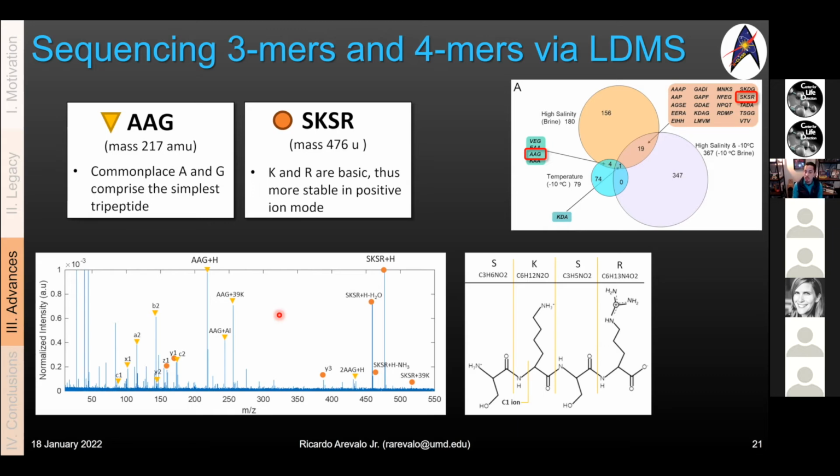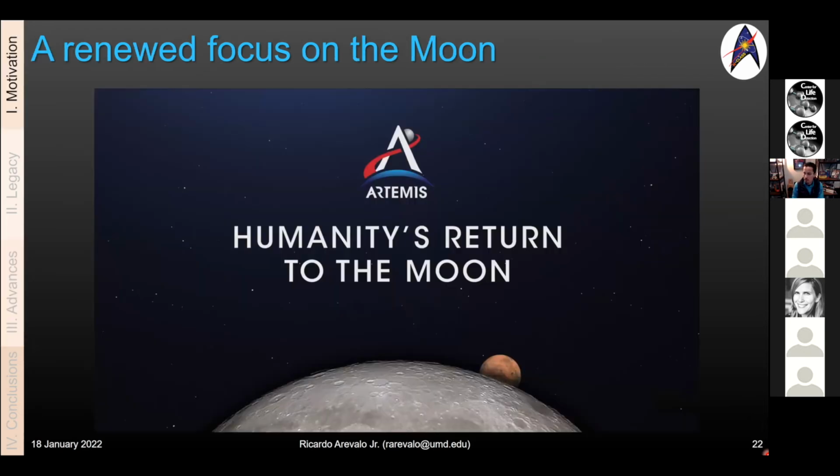And we can sequence at least a subset of the peptides that we've had the opportunity to analyze with our prototype instrument that meets the form and function of a flight model. We're able to see the molecular ion, we're able to see diagnostic fragments, and we're able to actually sequence these peptides. Okay, so I'm running out of time here, but the applications aren't limited to ocean worlds.